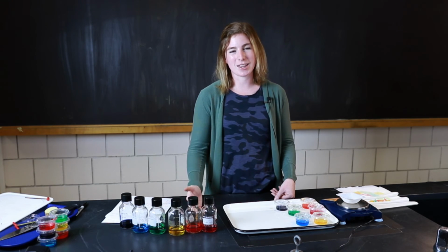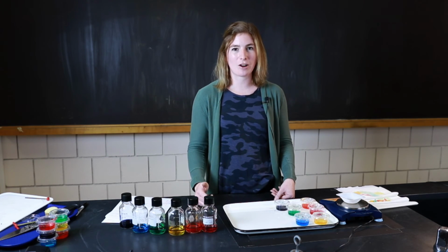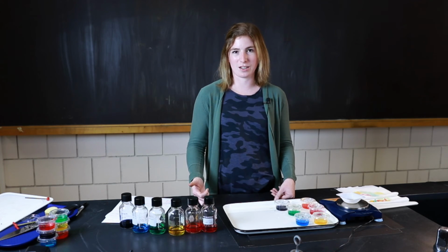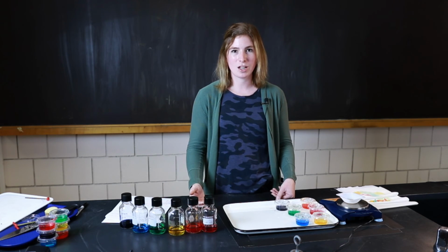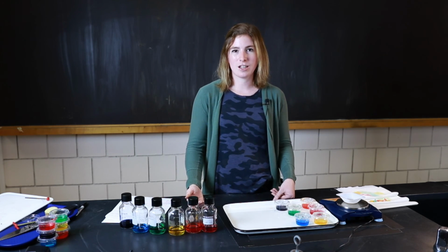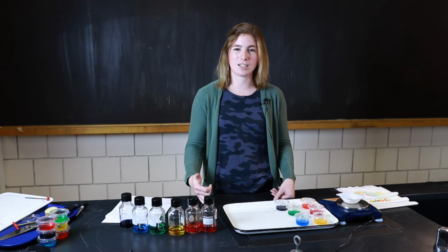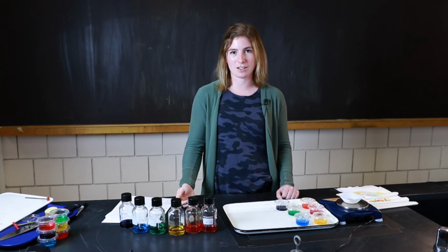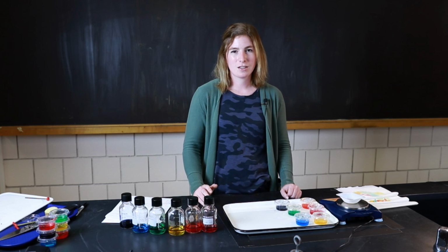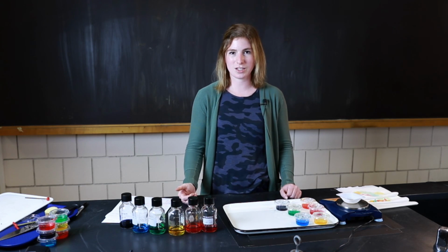It's very important that you get your percentages and your percent change in mass accurate, so that you will be able to figure out what the actual molarity of a potato cell is. We're going to be using these concentrations to help us figure out what is the molarity of a potato cell, which should be exactly where we would expect no change in mass, right? Because if the molarity of the potato cell is equal to the molarity of the solution outside of it, we wouldn't really expect any change in the mass. We would expect them to be at equilibrium. So go ahead and do your calculations. You will use those to create your graph and to answer your analysis questions, and then we'll be all set.